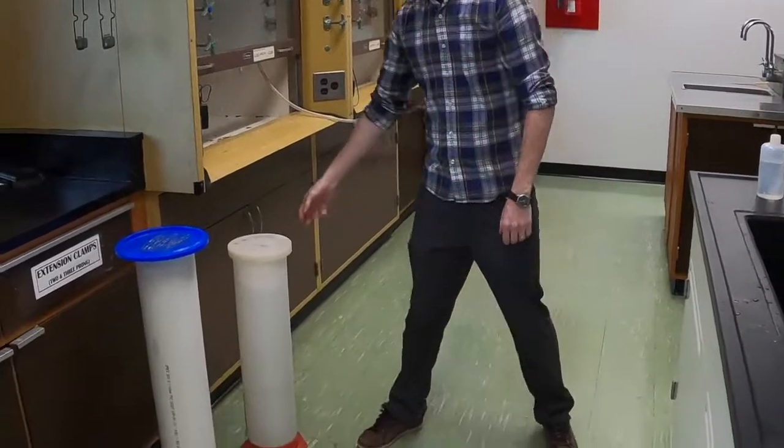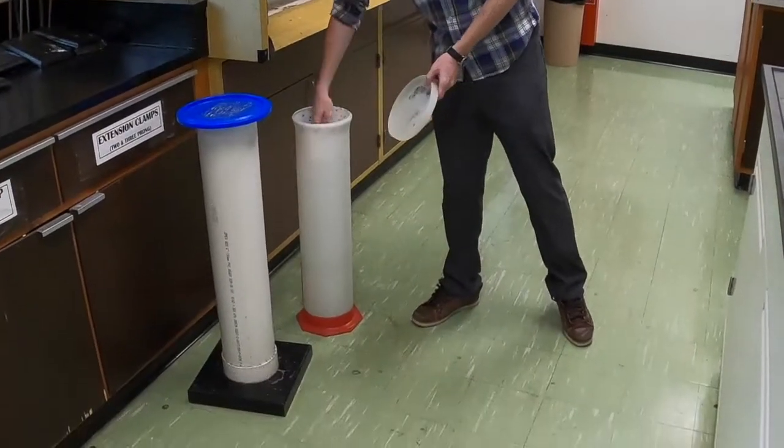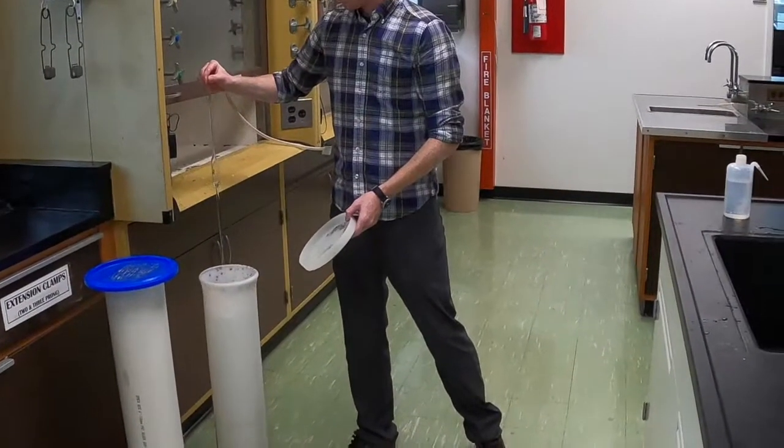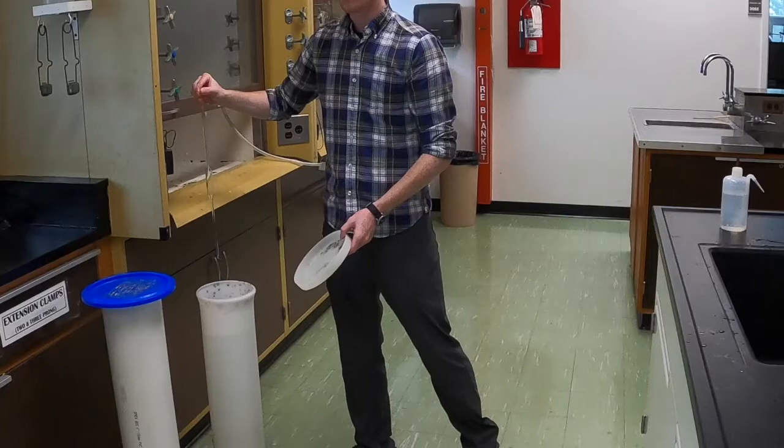Volumetric pipettes and burettes are stored in tall plastic containers around the room. Inside the shorter containers, you'll find pipettes stored in a detergent bath. And inside the taller containers, you'll find the burettes also stored in a detergent bath.